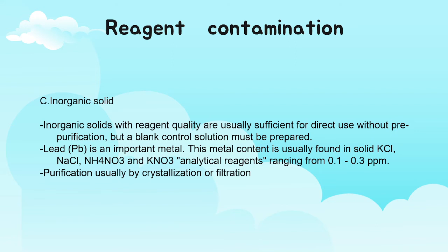This metal content is usually found in solid KCl, sodium chloride, NH4NO3, and KNO3 analytical reagent, ranging from 0.1 to 0.3 ppm. Purification is usually by crystallization or filtration.